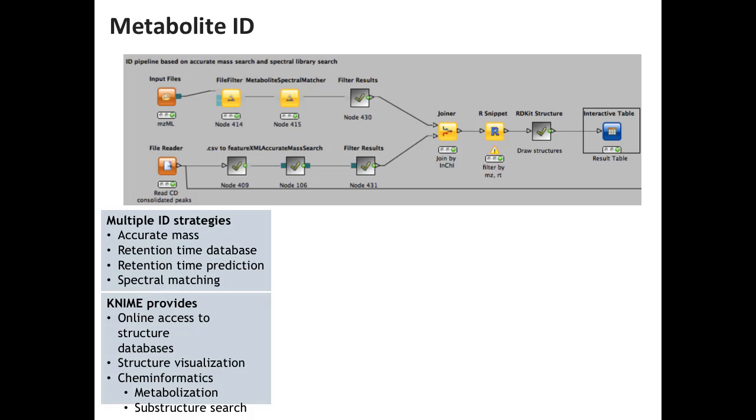Well, the easiest way is you just look at the accurate mass. Accurate mass, not the exact mass. Yeah? But you compare these accurate masses to the exact masses that you have in databases, and that can be done by just entering this mass into an online web server and see what pops up.